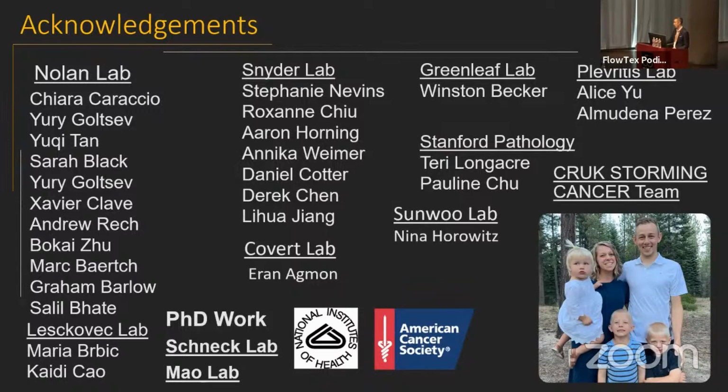Totally. Yeah. So great question. Initially, we were using computational techniques to separate out the cells, like a watershed segmentation. We moved to a deep learning method where we're able to now basically throw in the images and it annotates based on training data. And that works much better. Still not perfect, like you said. And that's why it takes a long time in the cell type annotation, is it requires a person in the middle just to make sure that what we call a CD4 T cell is a CD4 T cell.